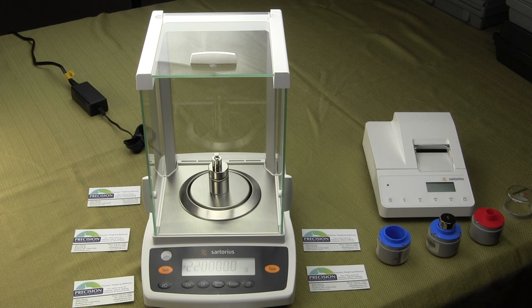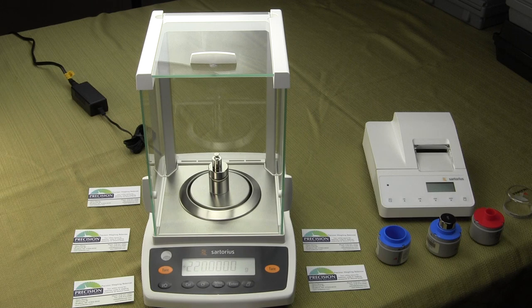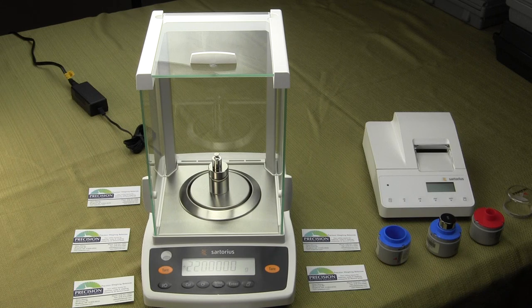It has a weighing capacity of 220 grams with resolution to 4 decimal places in grams. That's 0.0001 gram, or one-tenth of a milligram.